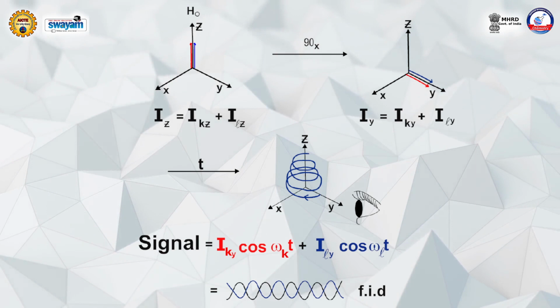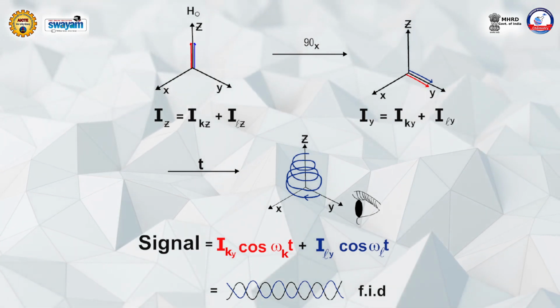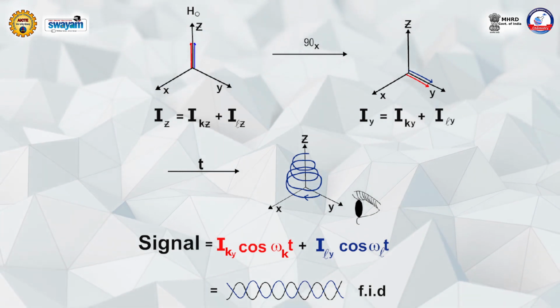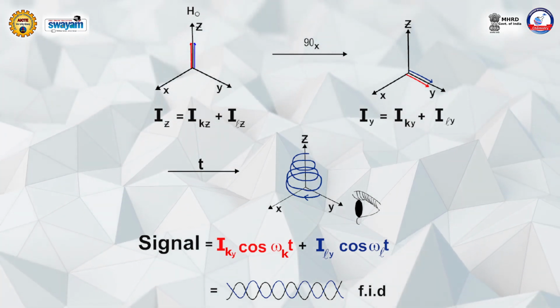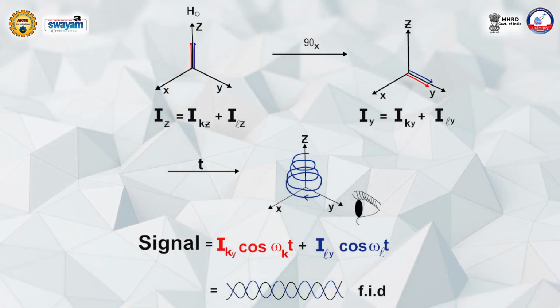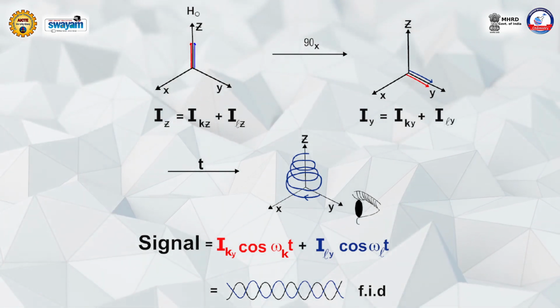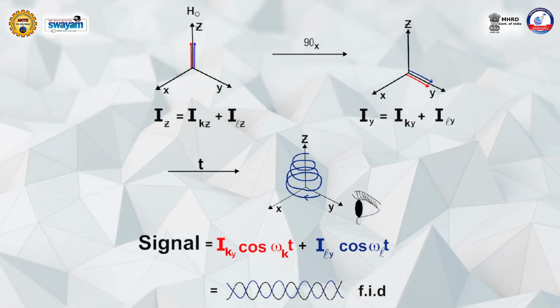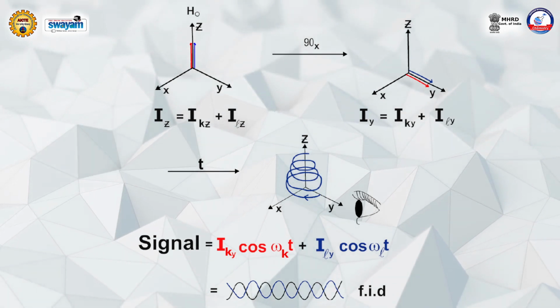As it is recovering in the spiral manner, there are magnetic moments oscillating in the transverse plane. These oscillating magnetic moments in the transverse plane will induce a voltage in a detector which you will have on the transverse plane. That small coil there is a kind of detector, and it will see an induced voltage. So rotating magnetization will induce a voltage, and that will be my NMR signal.